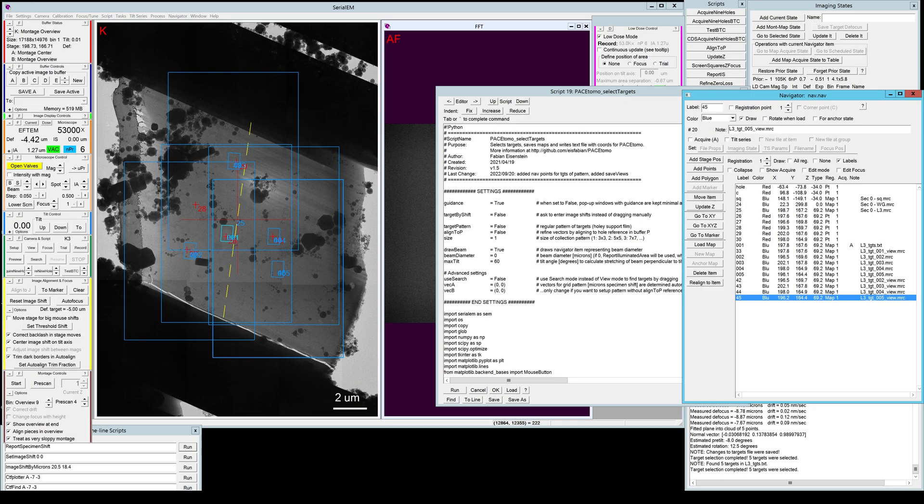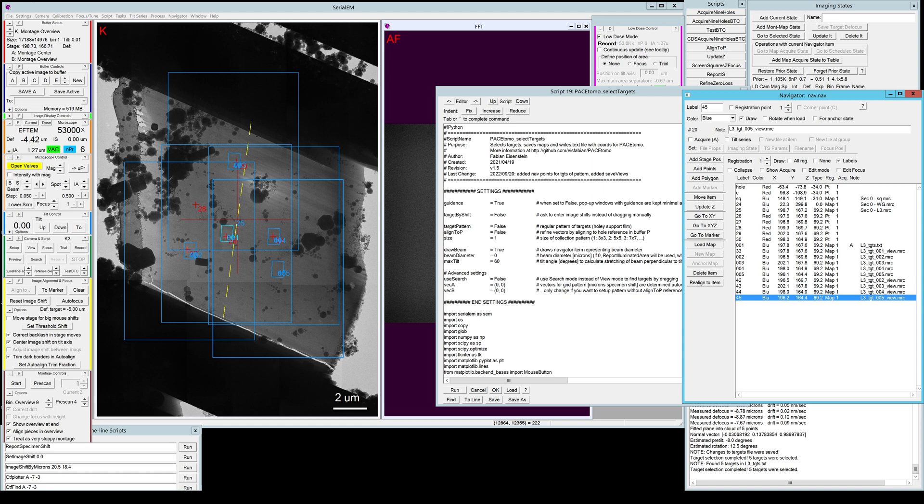Hey everyone, this is another tutorial for the parallel cryo-electron tomography or PaceTomo. In this video I'm going to show you how to run the actual acquisition script after you already set up all your target images as you can see here. If you haven't seen how to set up your targets please go to the previous videos. I will make sure to link them all down in the video description.